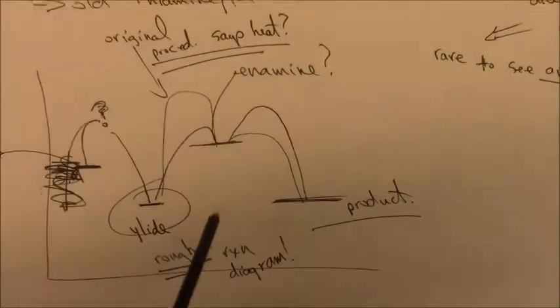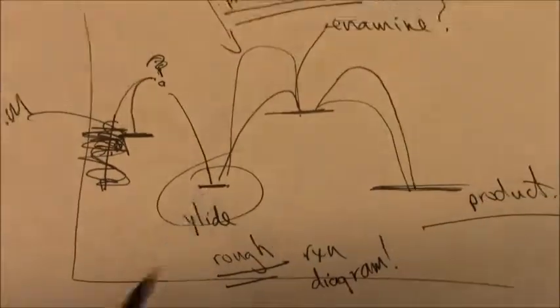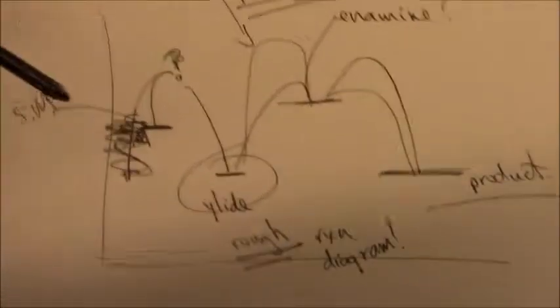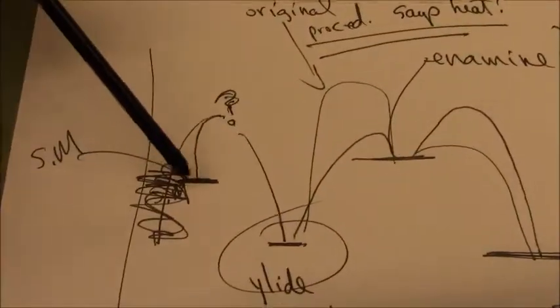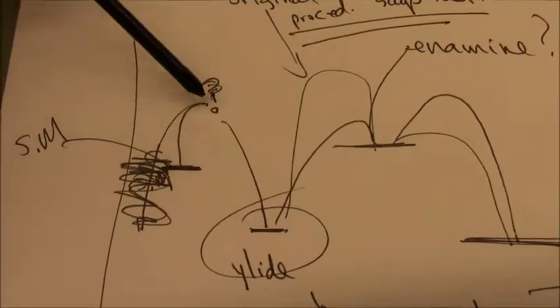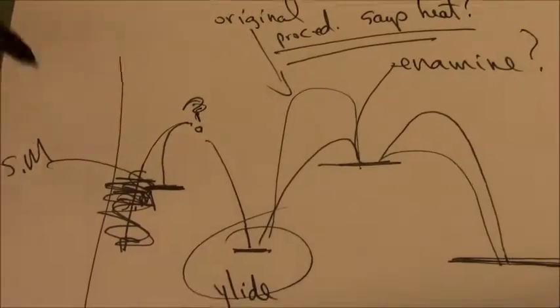So when you make this reaction energy diagram, I don't expect anything that's great, but in conjunction with some of this information from this mechanism, you can easily say things like, when you start off with your starting material and you add base, it tells you to keep it cool while you're forming what they call a ylide or an intermediate you're going to use.